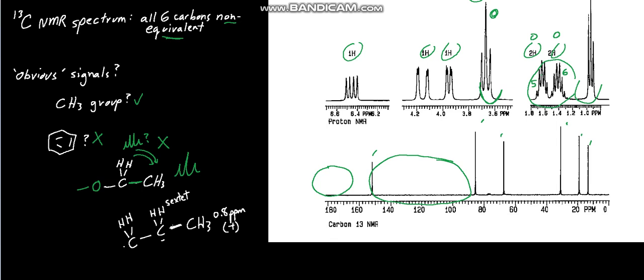and that is then established to be connected to that methyl group. And also connected to another CH2 group. Now let's look at this CH2 group. It's clearly not just a triplet being split twice. So it also has a CH2 group next to it, connected to it. What would that give us? 1 signal for those 2 hydrogens, split 4 additional times. Yep, sure enough, that gives us our pentet.